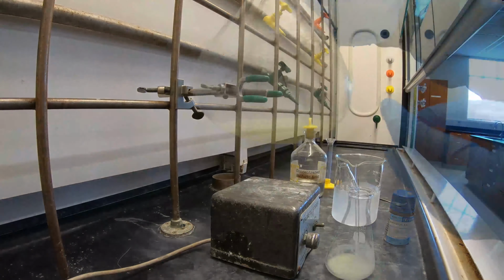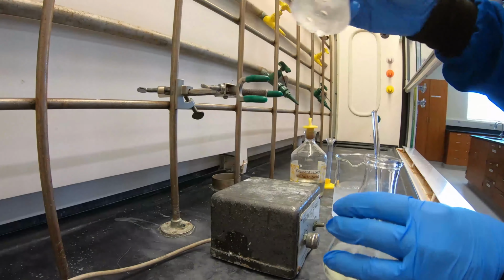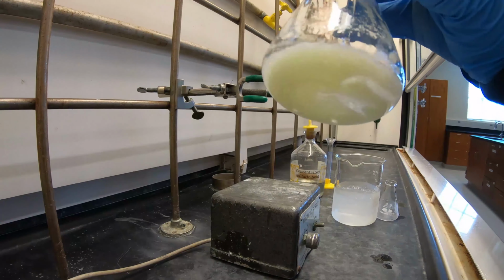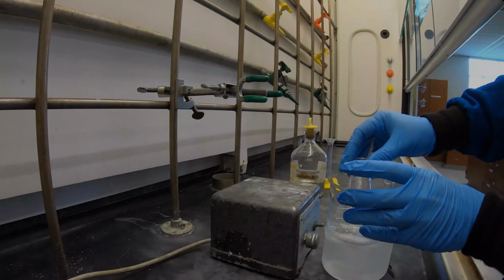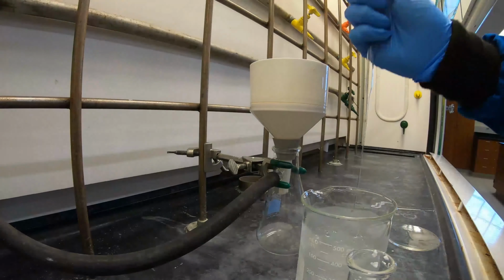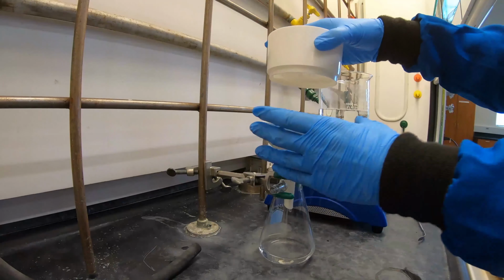Continue scratching with your glass stir rod until a large amount of product is crushed out. Then you're going to add 30 ml of cold water and break up any lumps with your stirring rod. Cool the mixture in an ice water bath until crystallization is complete. Set up your vacuum filtration system during your wait. Then set your filter paper using water and then filter your product and wash with ice cold water.